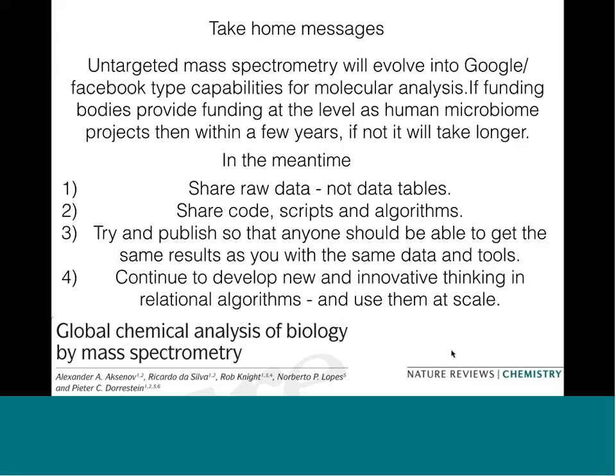So feature finding, for example, I would argue that right now is still an art and not really a great science. Different feature finding tools will give you slightly different information. And so having the raw data allows you to, in the future, update, let's say, feature tables. It also allows you to reanalyze the reference libraries.